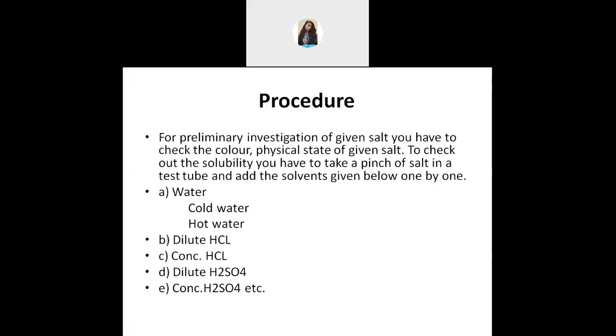What is the physical state of sodium chloride? Can you tell? Yes, crystalline, not crystallize. Crystalline. Physical state of sodium chloride is crystalline. So next you have to check the physical state. After that you have to check the solubility.